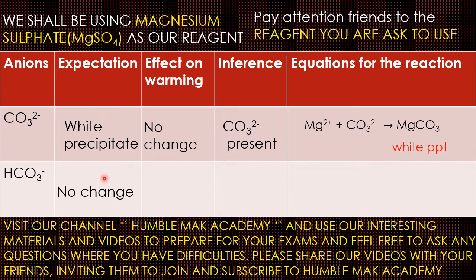So guys, now after adding our magnesium sulfate, the magnesium 2 plus is going to react very fast with the hydrogen carbonate ions to give us magnesium hydrogen carbonate, that's Mg(HCO3)2.